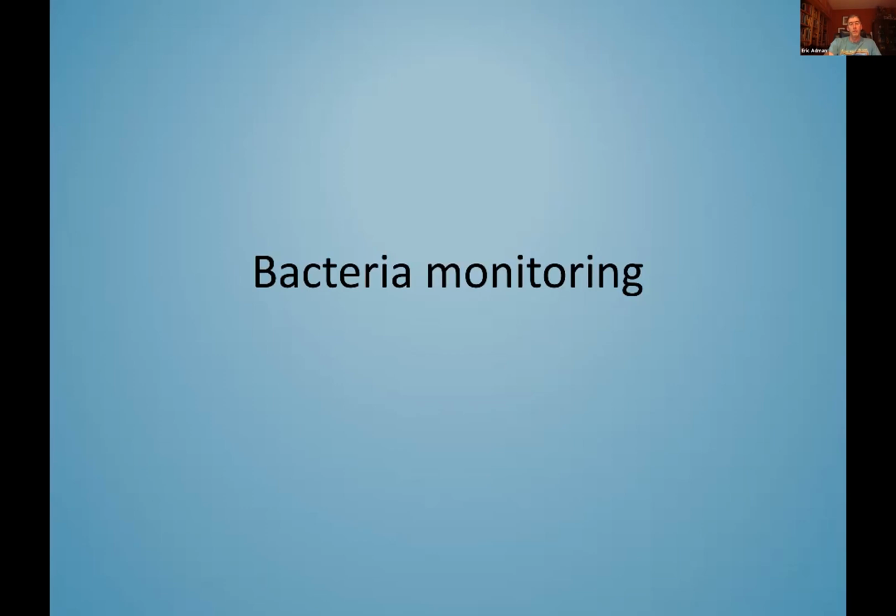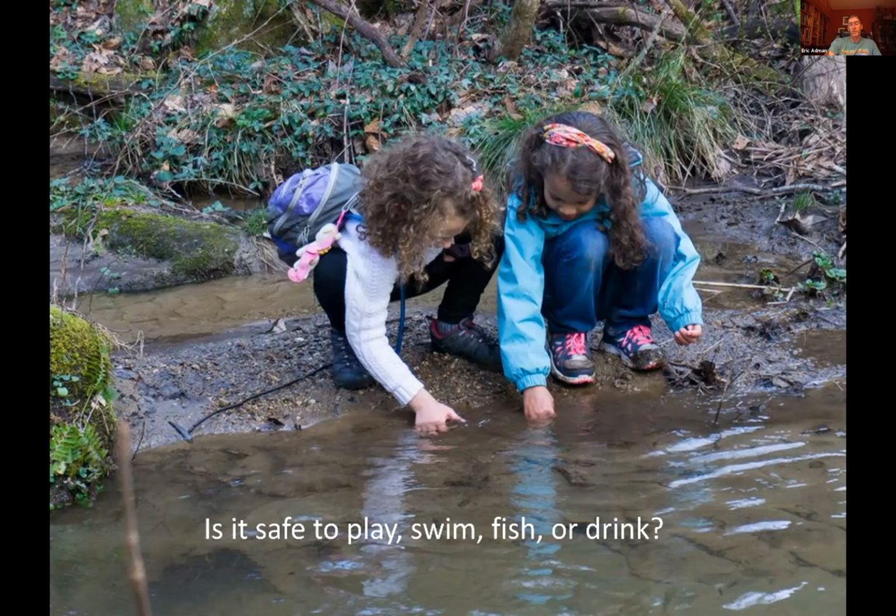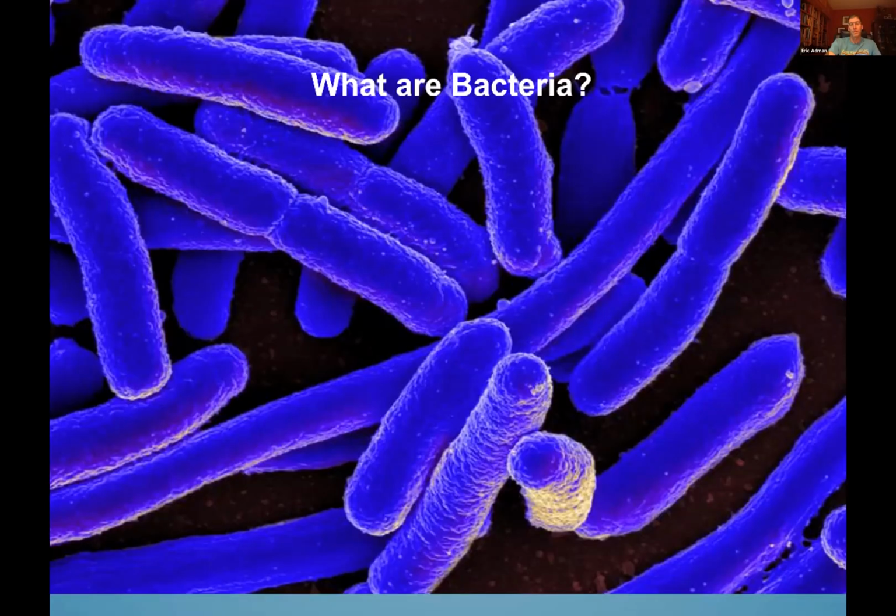Okay, we're going to get into the nuts and bolts now of bacteria monitoring. So the reason why we do bacteria monitoring is we want to know, is it safe for you to do something in that stream? And if the bacteria level is too high, then it might not be safe for you to get in contact with the water in that stream.